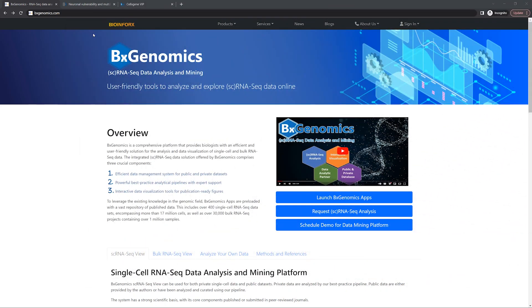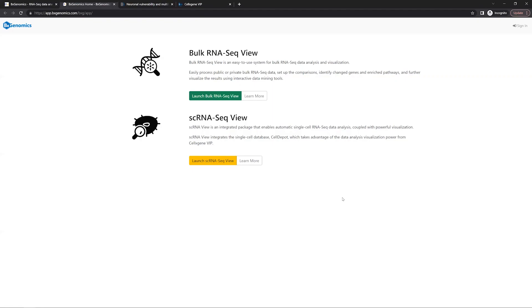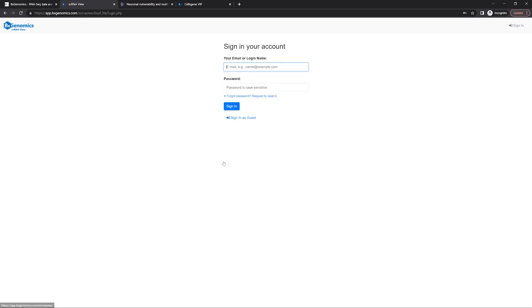Please visit BxGenomics.com to get an overview of the platform. From this webpage, we can launch the BxGenomics app. Within the app, there are both bulk RNA and single-cell RNA data. We're going to use the single-cell RNA-seq view today.